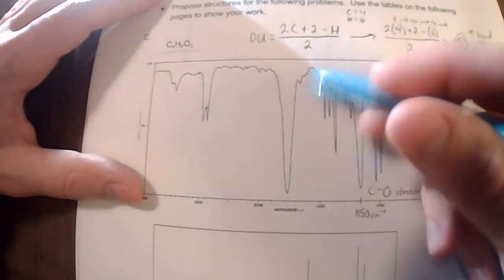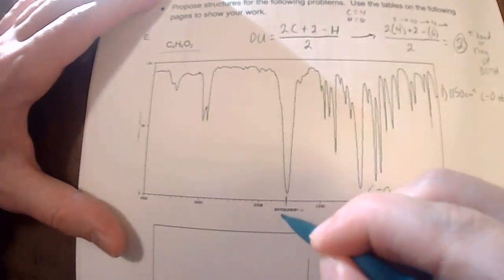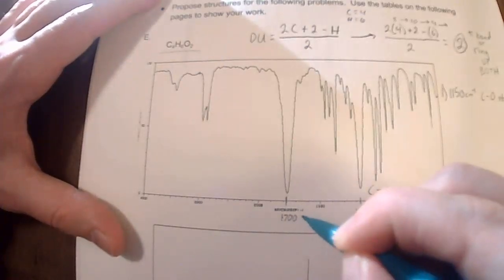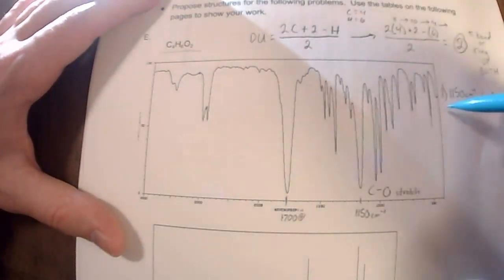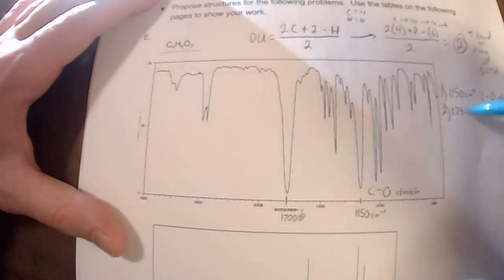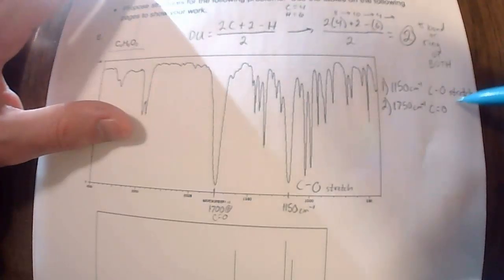And the other oxygen is right here, a little bit downfield of the typical 1700. I should say 1750. So it's being pulled a little more downfield, indicating an electronegative group beside that carbon. This is a carbonyl stretch. A little further downfield, maybe it's bound to an oxygen. We will find out.